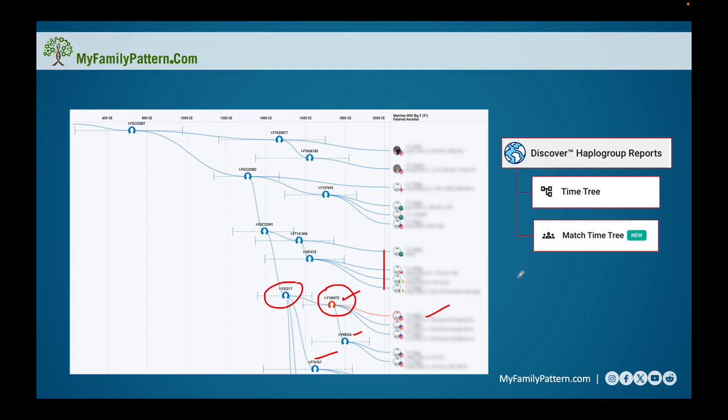So one of the things that I want to point out to you here as well is if you hover over any of these haplogroups, what's going to show up is a dialog box that shows you when your common ancestor, that is represented by the mutation that created this haplogroup, when they were approximately born.